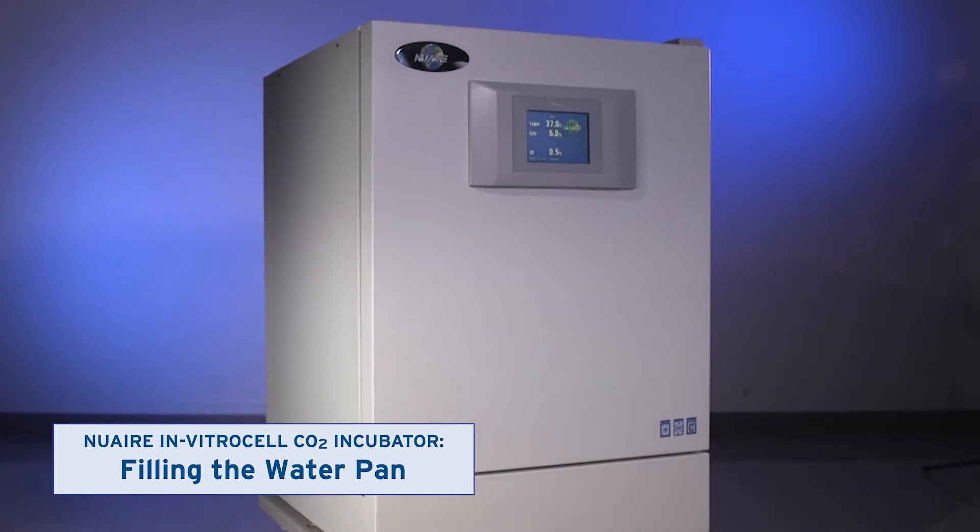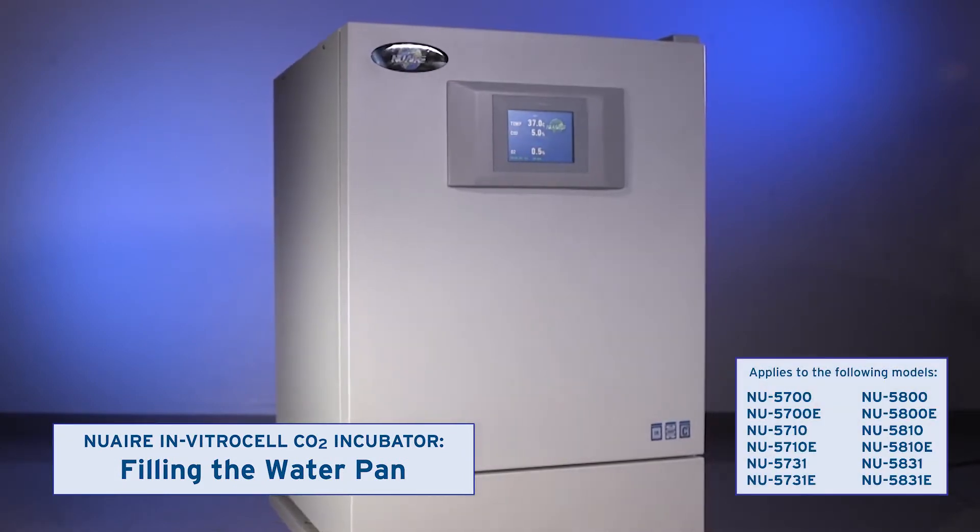This video shows how to fill the water pan in incubators with passive humidity control.